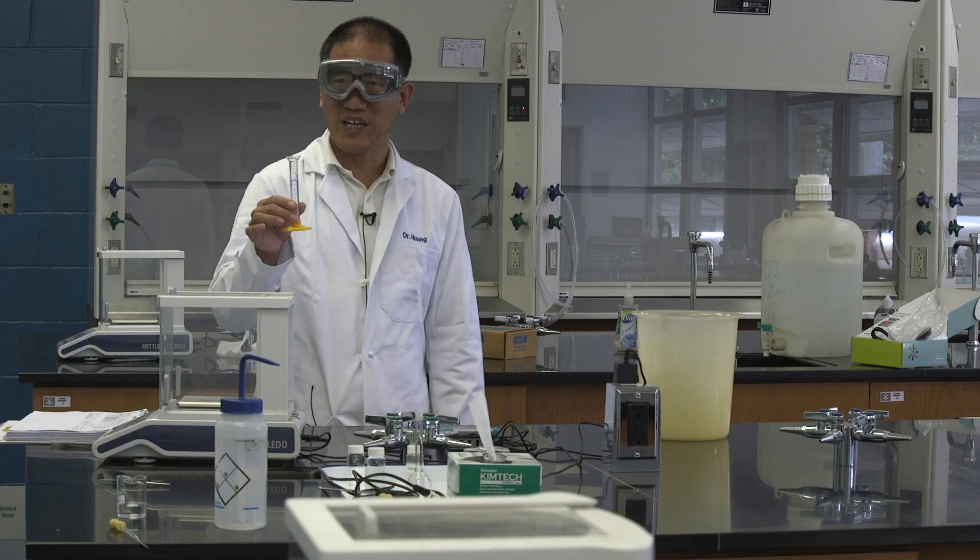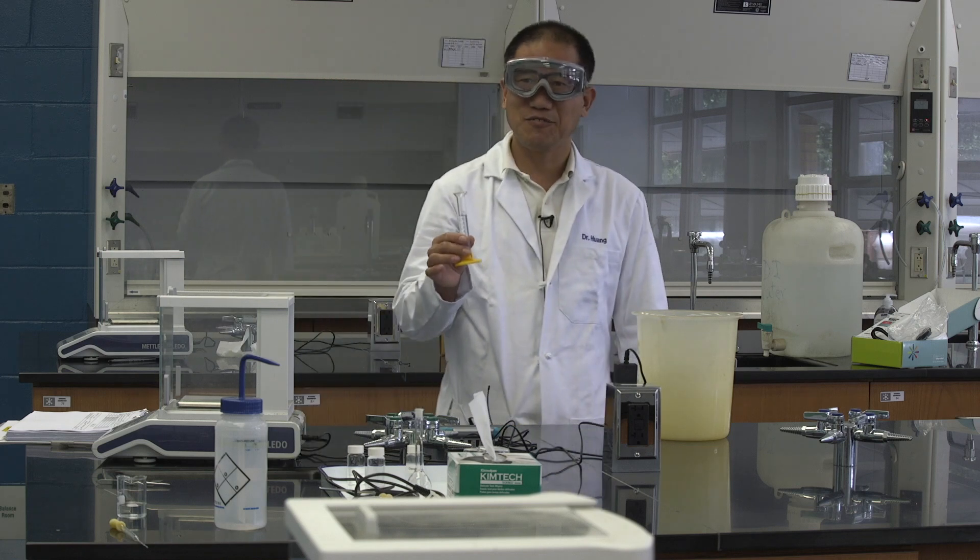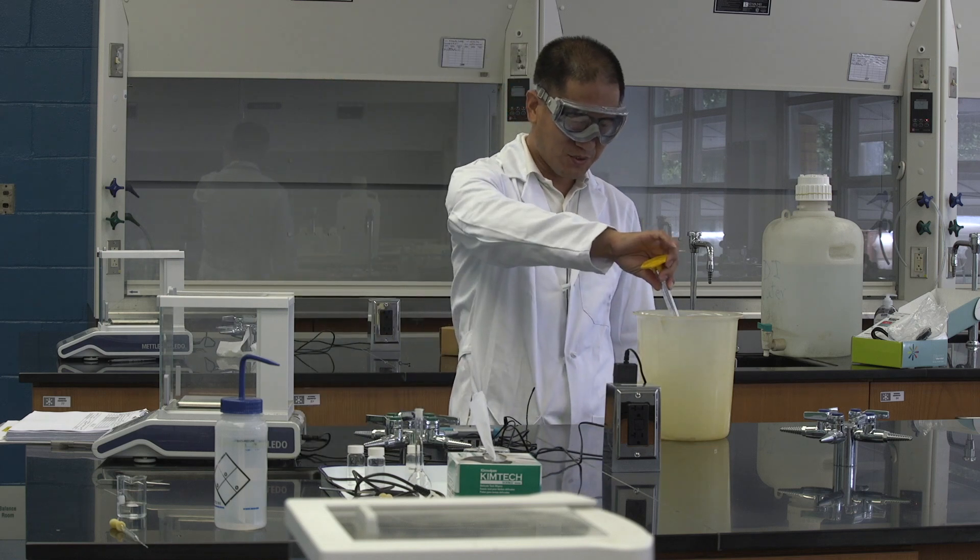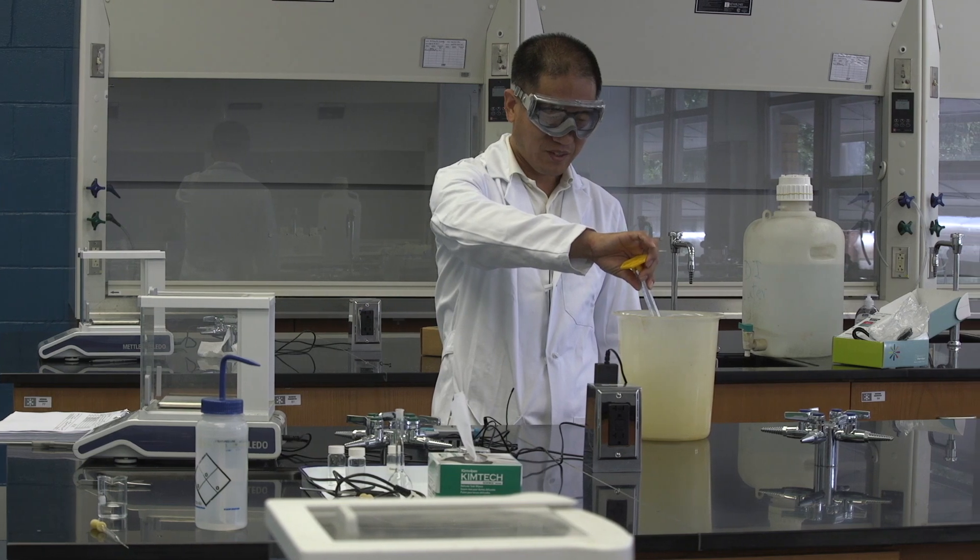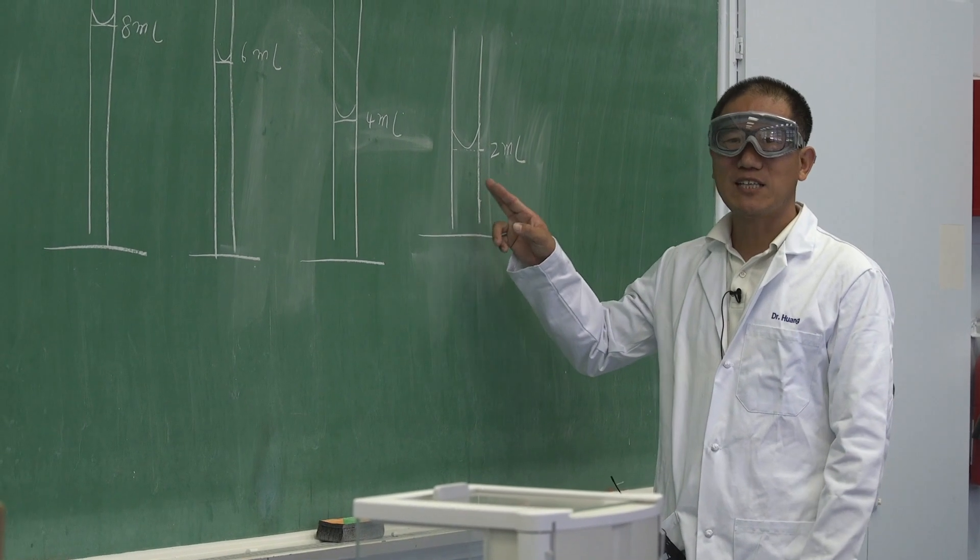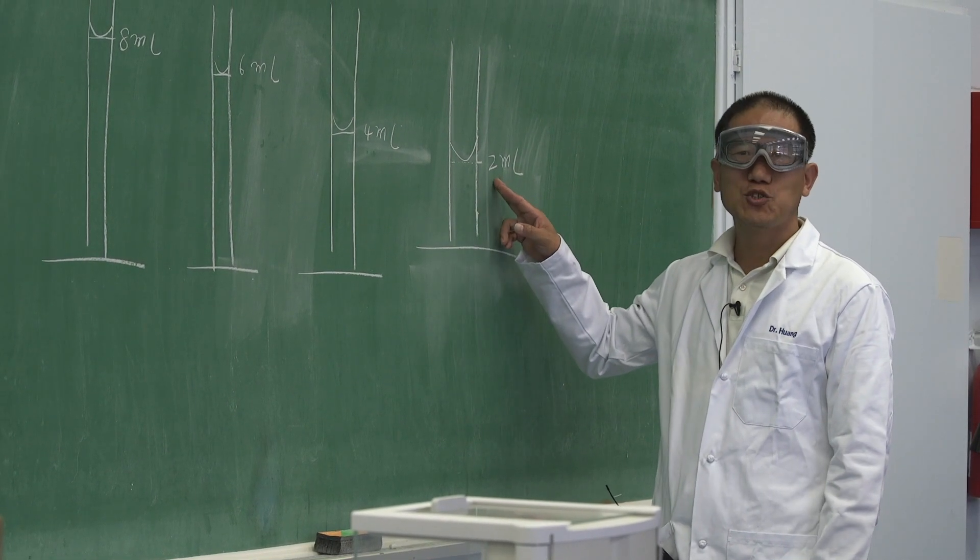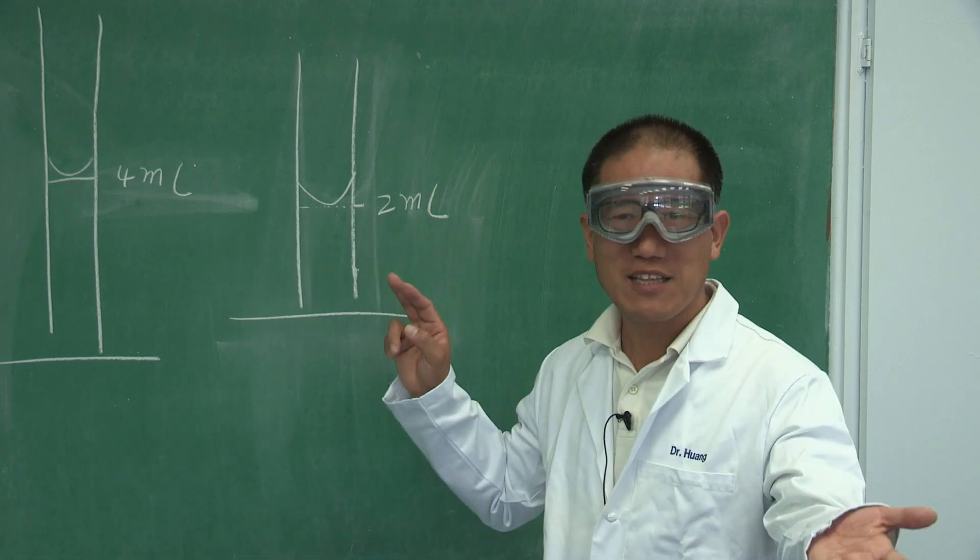For any chemical waste, including water, it has to go to the dedicated waste container. Let's do this right now. Next step, we will add unknown liquid instead of water to the same graduated cylinder. First, add to 2 milliliter mark, get the mass.